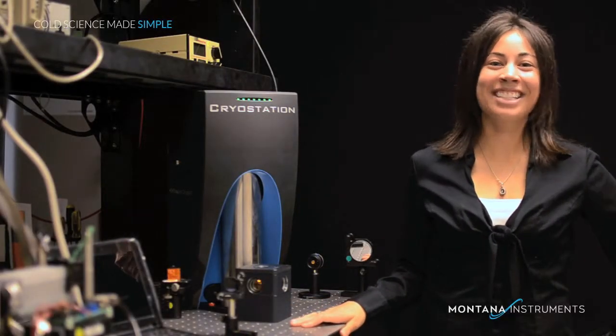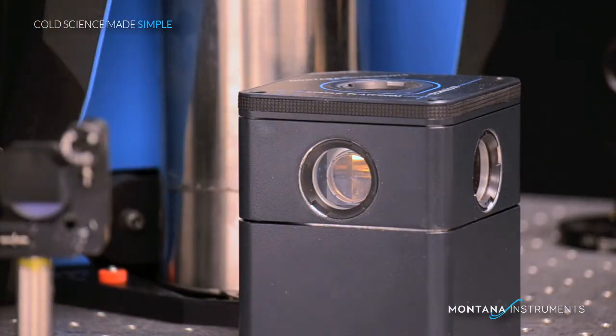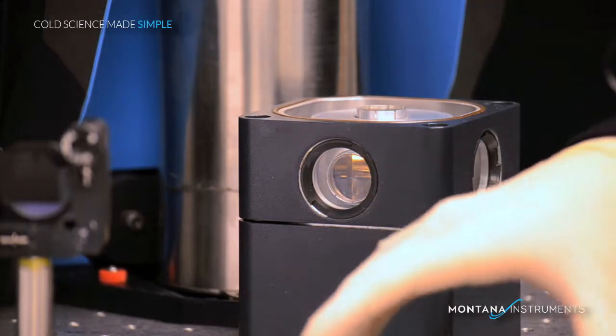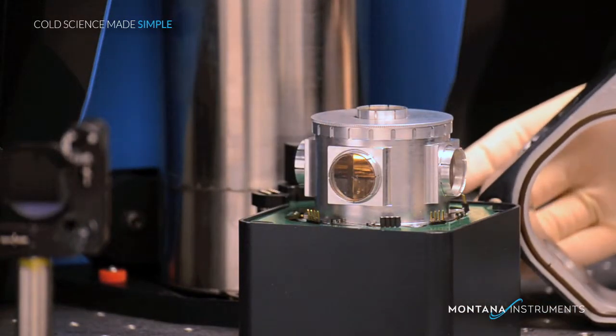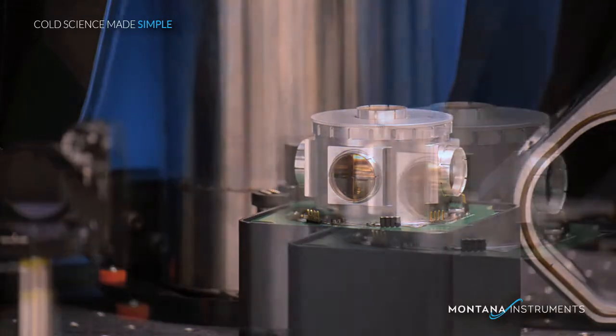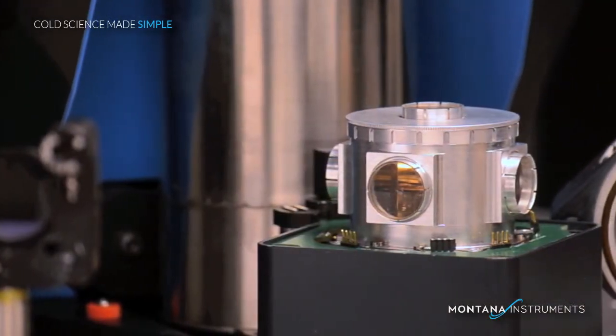Hi, I'm Katie and I would like to give you a tour of the sample chamber of Montana Instruments Cryo Station. Starting with the unit at room temperature, you can remove the lid and also the entire window assembly. There are no bolts that need to be removed, and these are held in place firmly by the vacuum during operation.